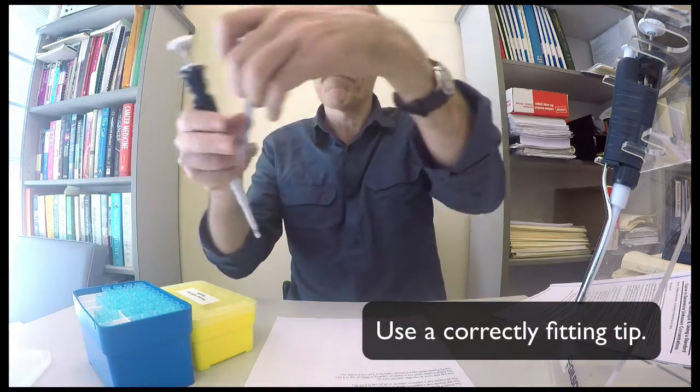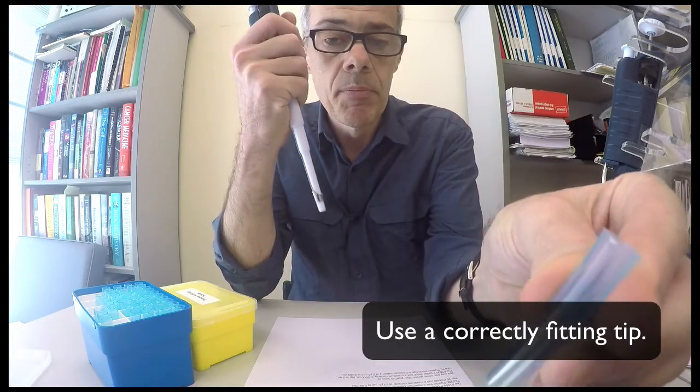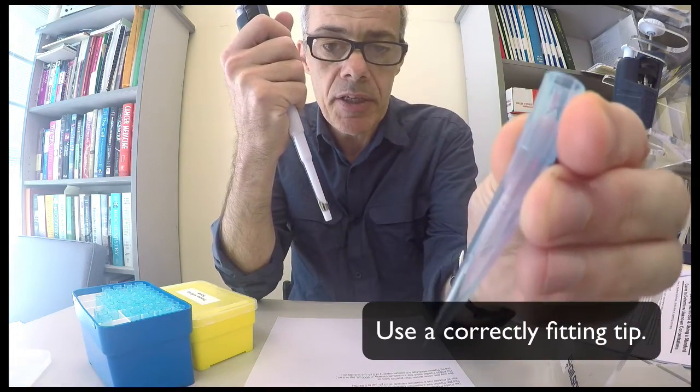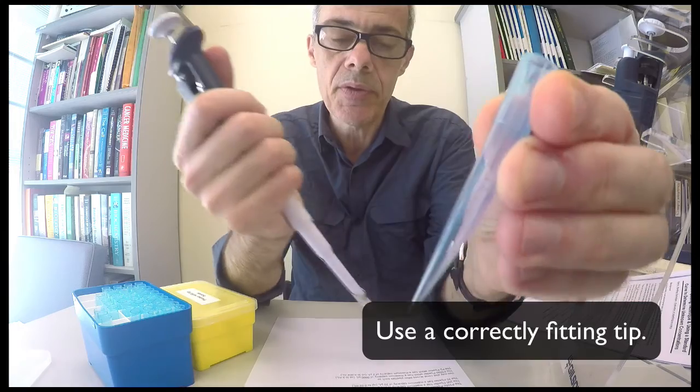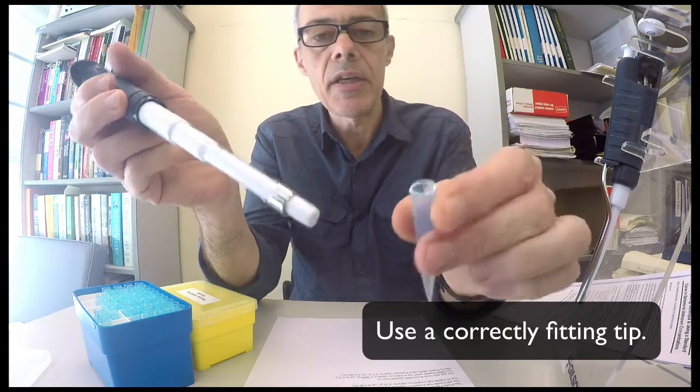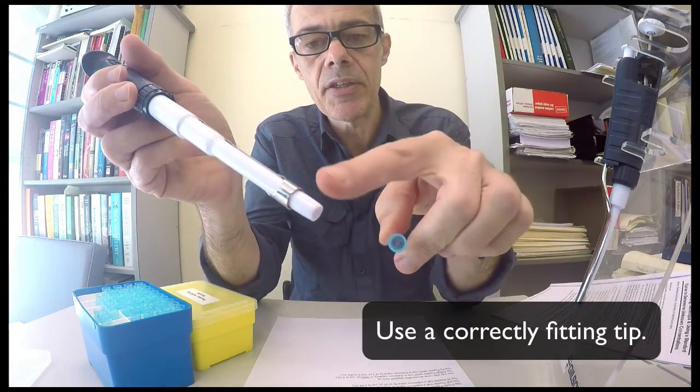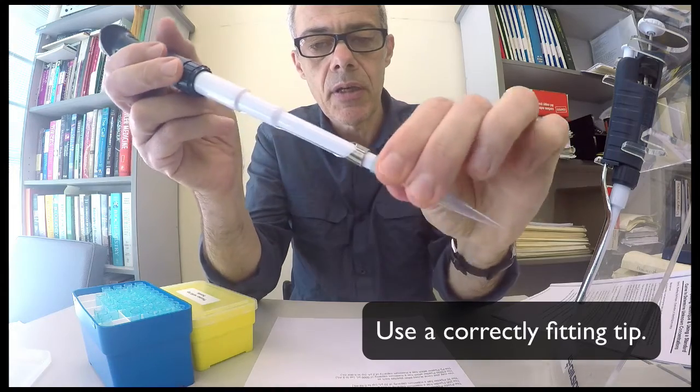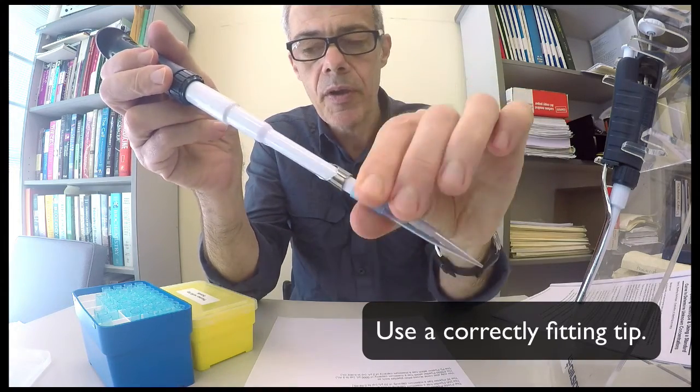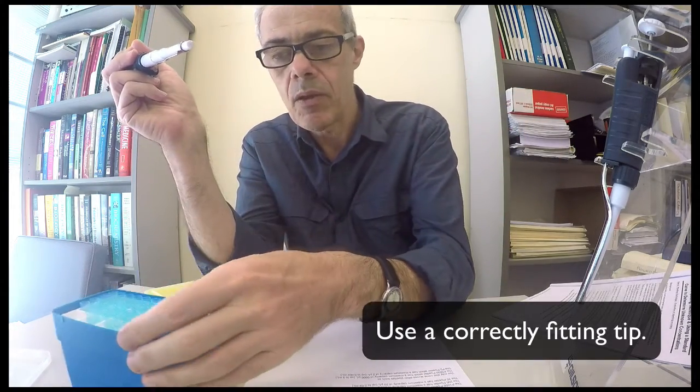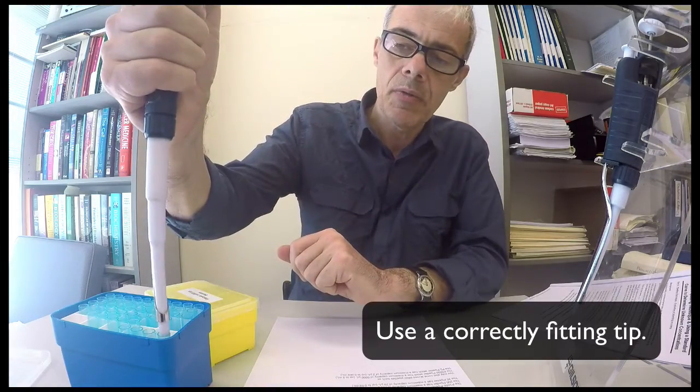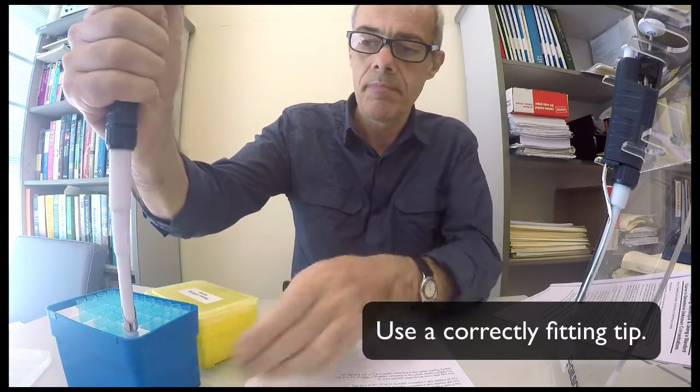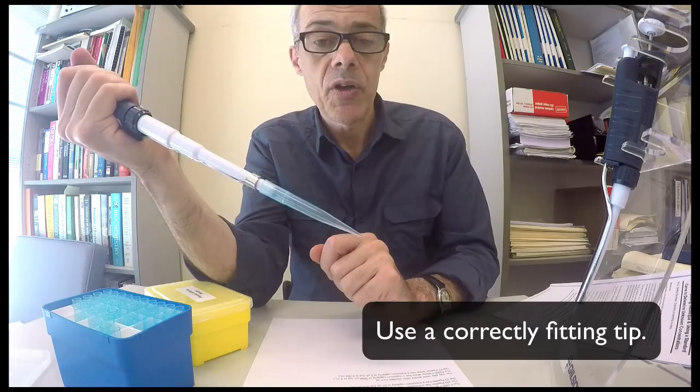This is what a blue tip looks like. These tips fit the P1000 and you'll notice that the diameter here matches the diameter here, so it just clips on. So effectively what you do is just lightly put it on.